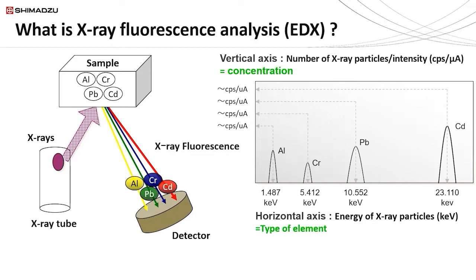Okay, so how does EDX work? What you do is you have an X-ray tube that emits a polychromatic distribution of X-rays, and those, for lack of a better word, impinge. They're incident on the sample. The X-rays electronically excite the atoms within the sample, which are composed of different elements. There's a process of electronic transitions, particularly intershell electronic transitions, occurring.